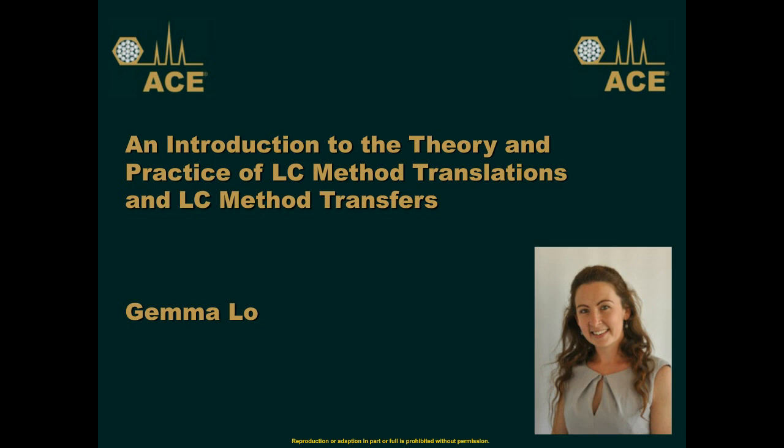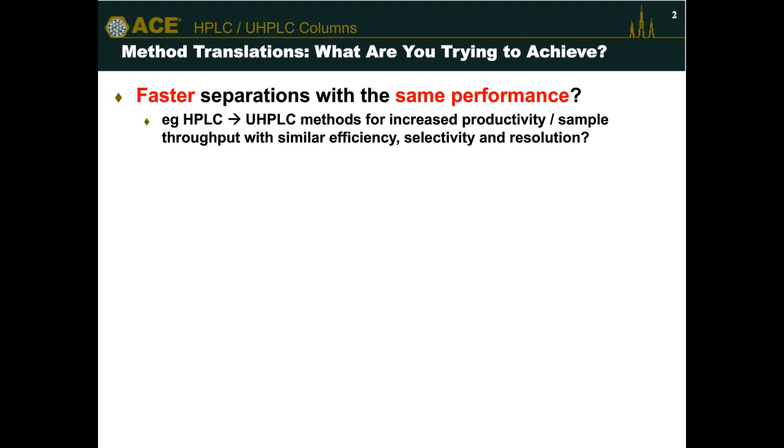Thank you very much for that introduction, and thank you to MacMod for inviting me to speak about method translations, some theory and practice. There are many reasons why we might want to transfer our HPLC method to a UHPLC method, for example. One of those main reasons is time, and time is money in the industry.